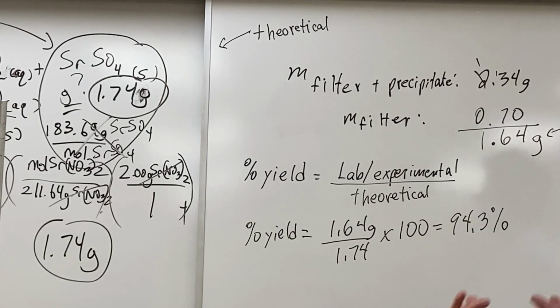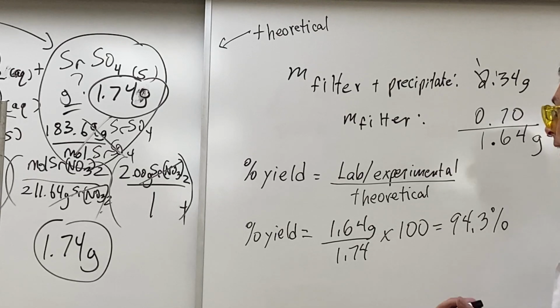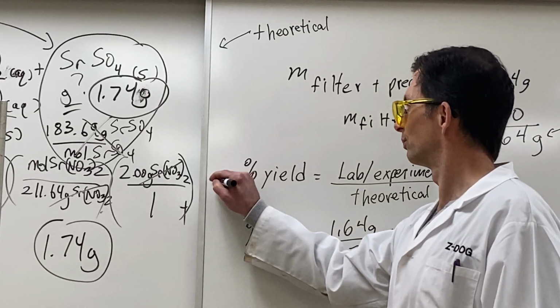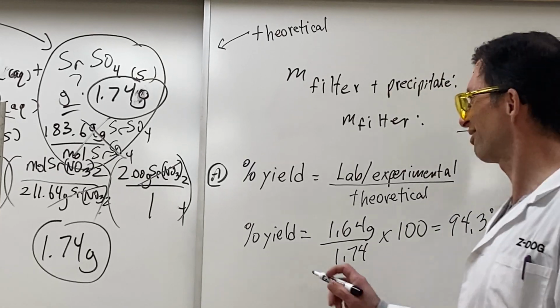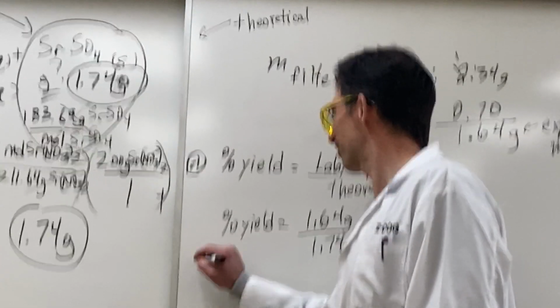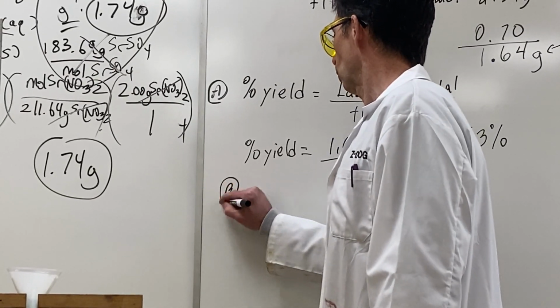Remember, any value within 10% is deemed acceptable in a high school lab, considering the equipment that we have to work with. What is acceptable in university? Oh, very stringent values there. You get marked on your results there. Mine was in university. Mine was within 2%. Whoa.